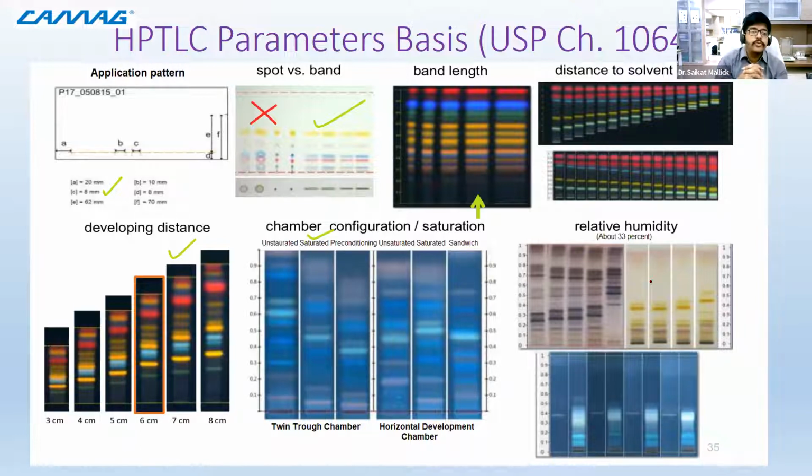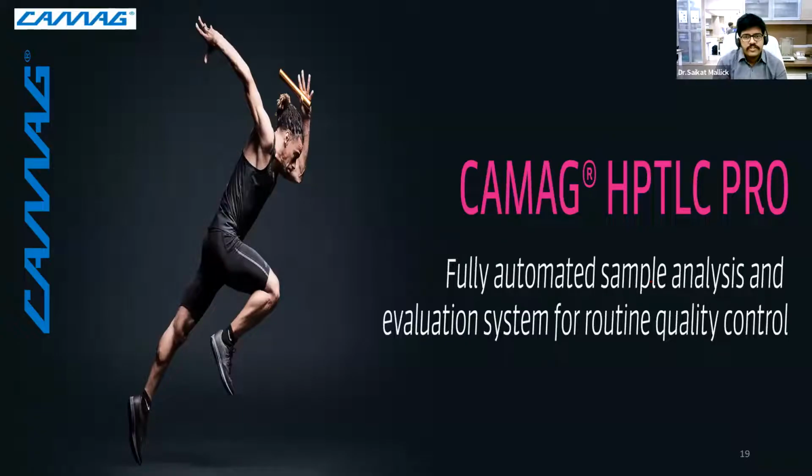As I told you, when you are going for bioautography studies, before the bioautography part, your HPTLC has to be done in a proper format, so that when you are publishing in a higher impact factor journal, you won't get any rejection. So all these things are an important aspect of bioautography studies.